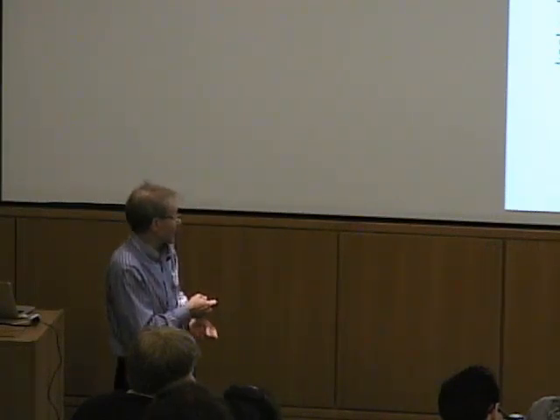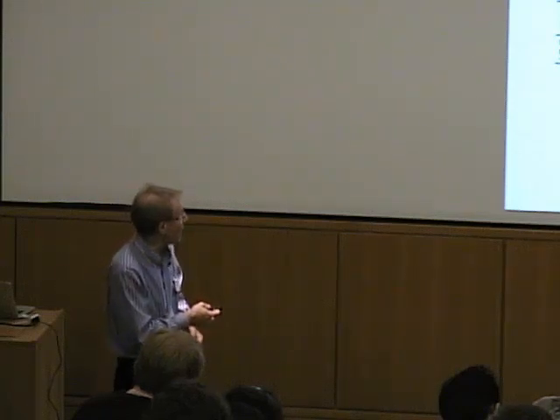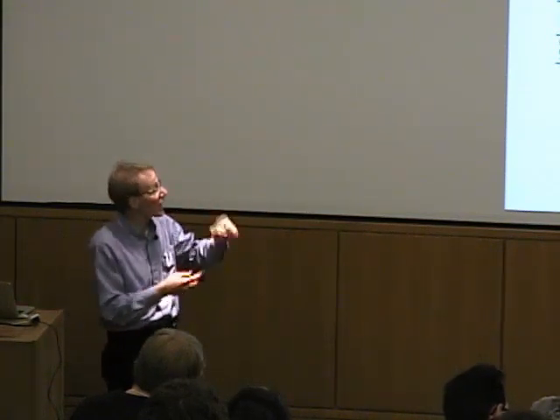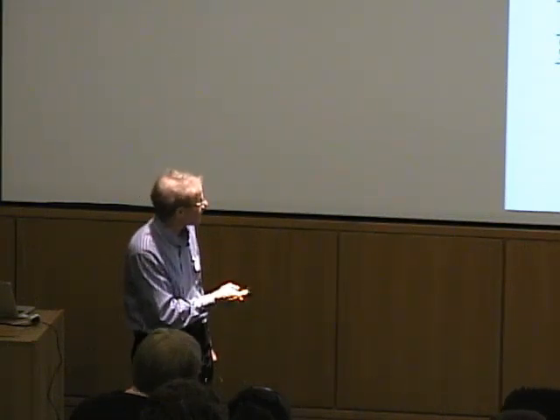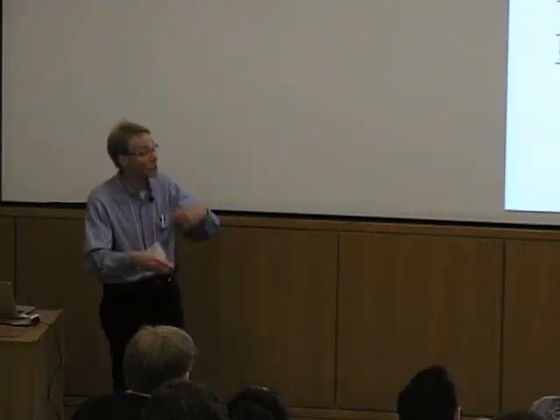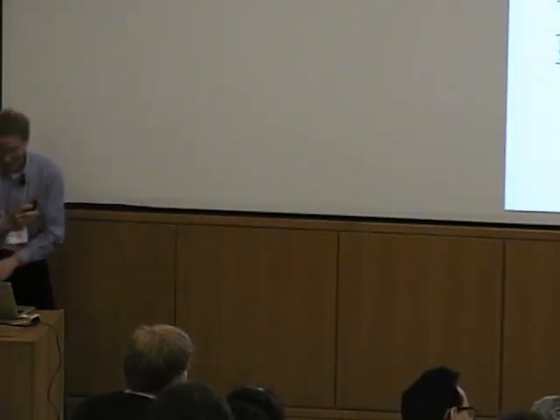So now we're going to do a titration. We're going to titrate the ligand into the copper, or we could do it vice versa. They bind in 1-to-1 stoichiometry, but in the presence of the buffer. So the thermodynamics that we get out of the fit here, if we compare that to what we get to binding with this, the difference is, in fact, the copper interaction with the buffer. Okay? So this is a way that we can start to develop this information for this post hoc analysis.